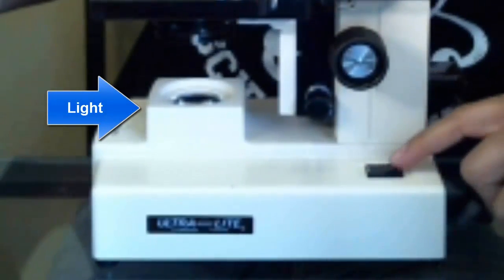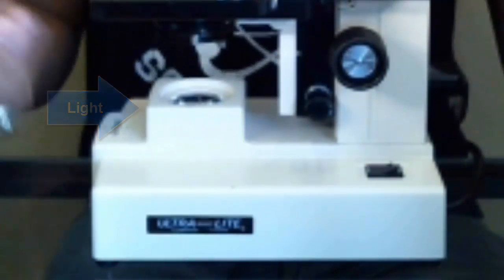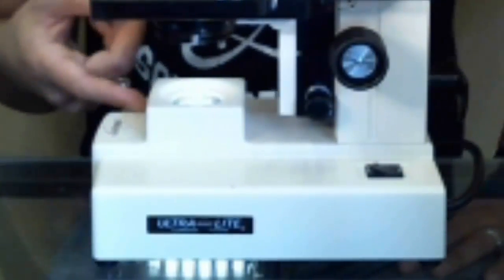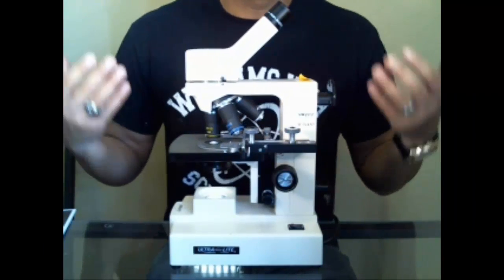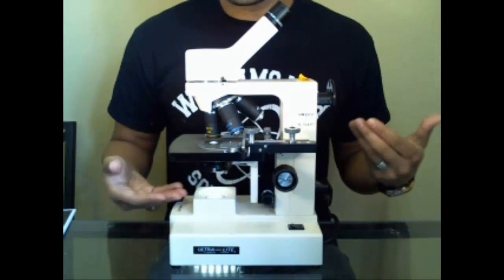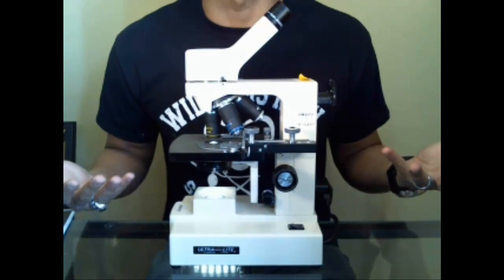When turning it on, make sure it's off when you're actually plugging it in so you don't short the bulb. Turn the off switch on, plug it in first, then push the on switch and you'll see a light turn on from underneath. This light is going to allow you to see an image — just like anything else, light has to get to your eyes and your eyes have to recognize that light in order to connect to the brain.